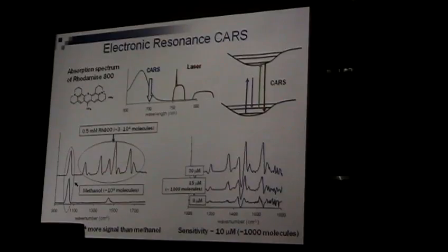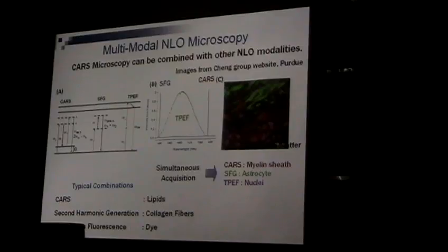So what I'm saying is, if you are lucky that your molecule has an electronic resonance, this, in theory, can detect single molecules by vibrational spectrum. So then it's actually big news. That's one project we are working on.